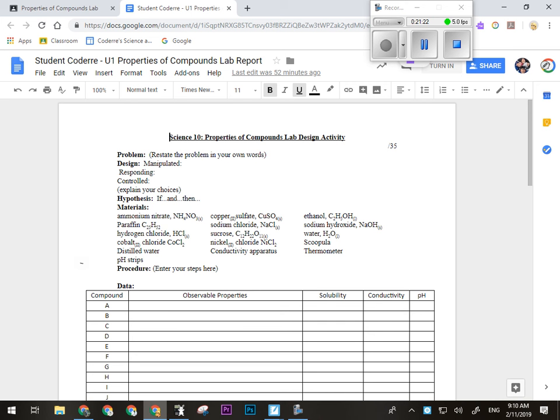So that would need to start out with things like, upon entering the lab, grab a set of safety goggles and place them over your eyes. That's kind of important. Don't say put them on. I've seen people do this. They think safety goggles go here. Last time I checked, they're not a forehead protector. They need to be here over your eyes. You need to be explicit.